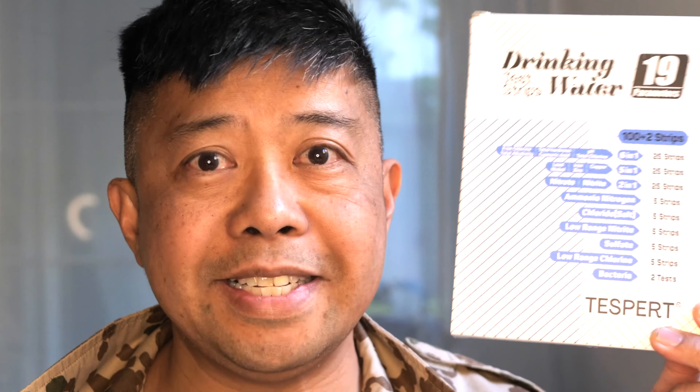Safe drinking water is the most important resource you can have in any emergency. And if your water is compromised in any way, how would you know? So these are test strips that allow you to test for metals, chemicals, and even bacteria. And we're going to test them out on this episode of Moondog R&D.